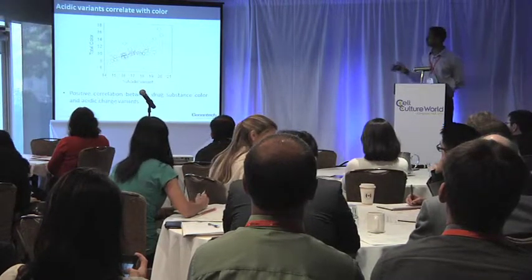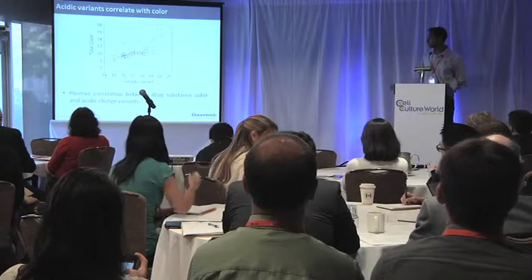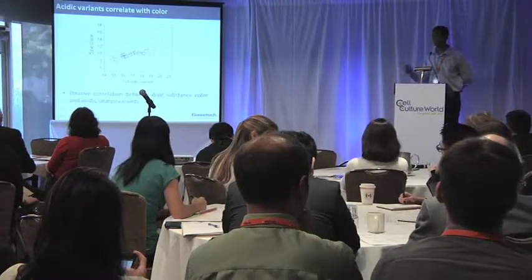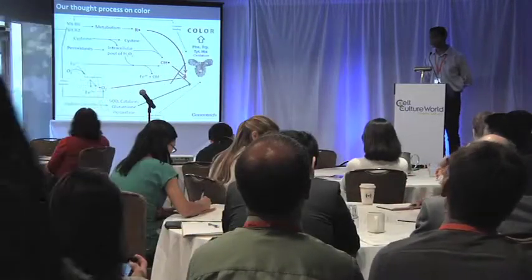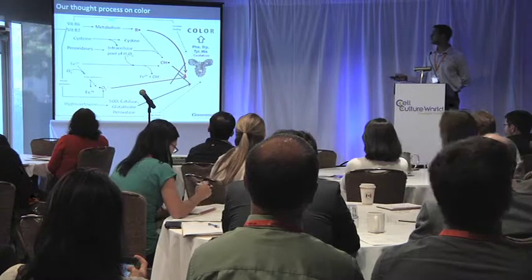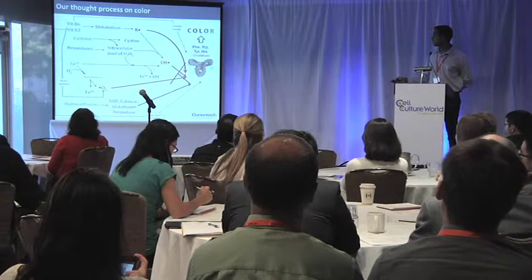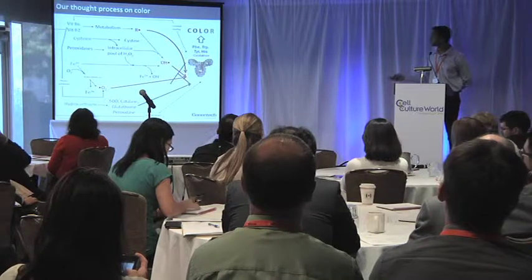Now, all this seemed to not make a lot of sense because we didn't even know what the mechanism of causing color was. But over the many studies that we have done, and with Yi-Yang's hypothesis that we have developed, we came up with this sort of thought process. And it's a very busy slide, but I'll try to simplify it. We believe that the main mechanism of color formation is the oxidation of amino acids on the antibody or therapeutic protein that we are producing.